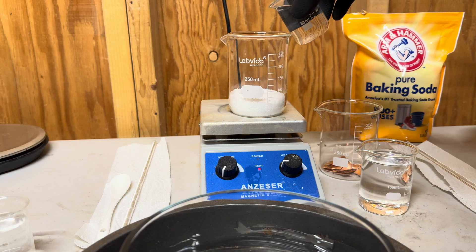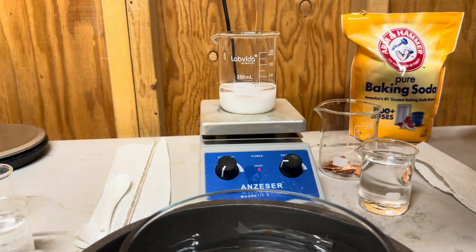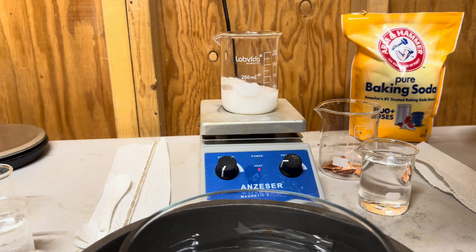Now we will add 50 milliliters of distilled water to our nitrate and we'll do our best to dissolve it. The temperature on our hot plate is set at low and this process took about five or six minutes.